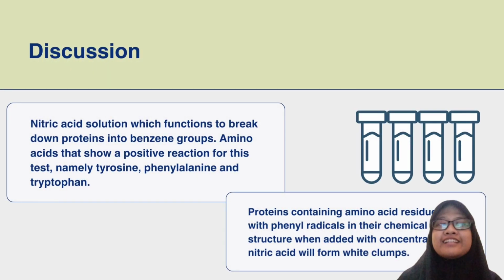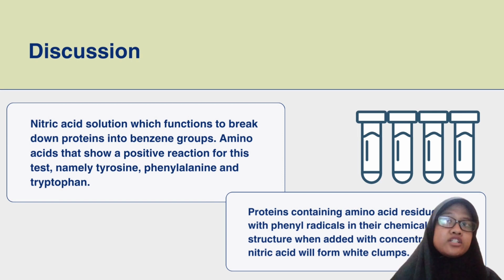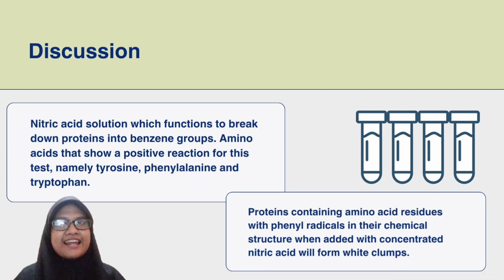At this point, I'd like to turn to discussion. So, nitric acid solution functions to break down protein into benzene groups. Amino acids that show a positive reaction for this test, namely tyrosine, phenylalanine, and tryptophan.